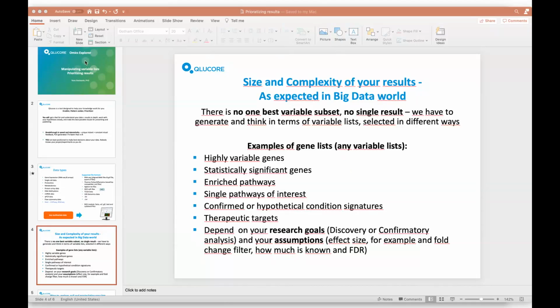So I will create a synchronized variable PCA, and we will look at both genes and samples. Left is plotting all 13,266 genes, and on the right we have 132 patients. Let's look, I wanted to show you filtering on variance.